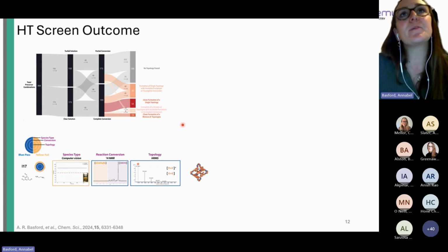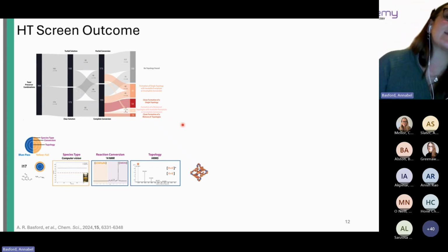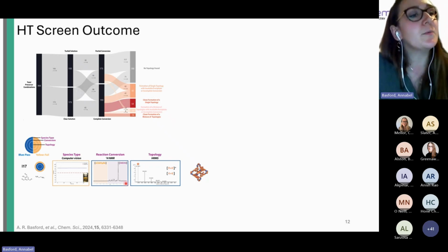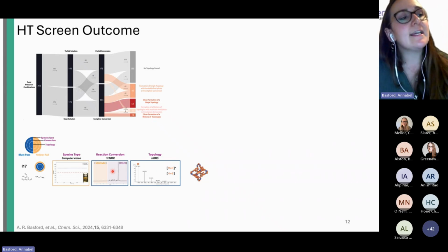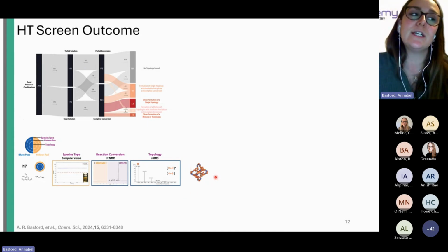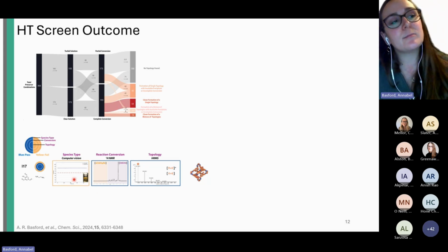Furthering this, even from a researcher's view, you think, okay, there are still accessible structures that only require one step of purification. So using the example below, we can see that in this case, this precursor combination resulted in full conversion via NMR. We saw a single cage topology, but we did see some insoluble precipitate.